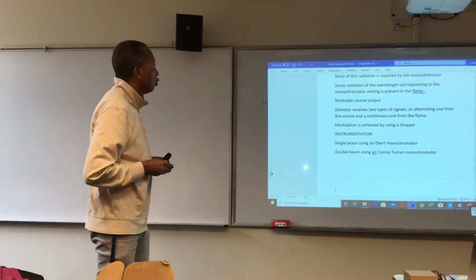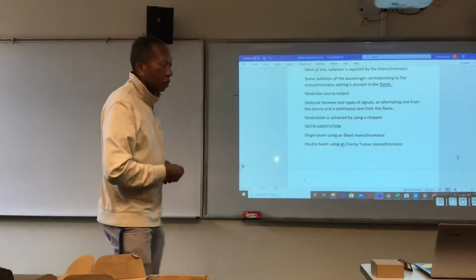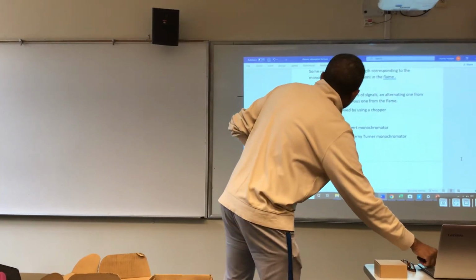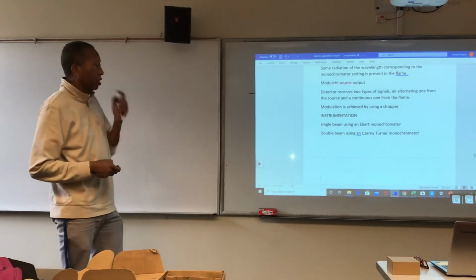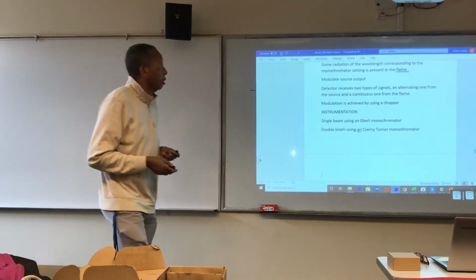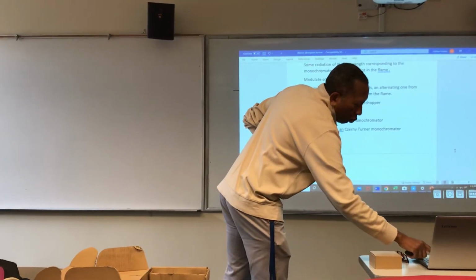Alright, so for instrumentation, we can have a single beam or we can have a double beam. We looked at single and double beam instruments. We know the advantage of double beam. The advantage of a double beam instrument is simply that we have a reference beam that we can compare the sample with.